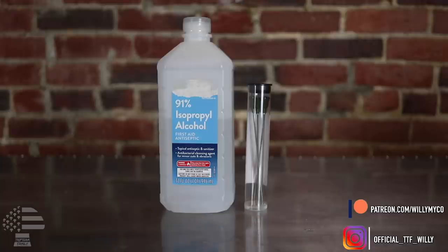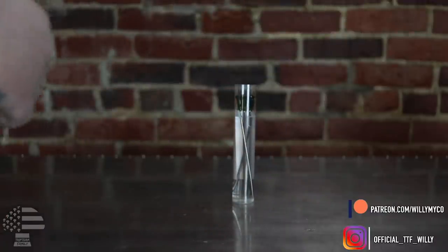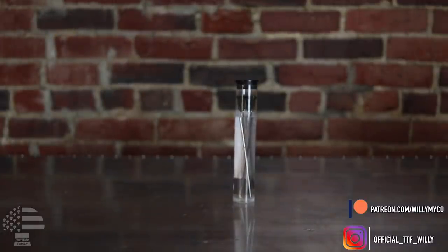First, make sure your liquid cultures are clean — you don't want to do this on LCs that could potentially be contaminated. I suggest testing all your liquid cultures on agar first to confirm they're actually clean. Once you know your liquid culture is clean, bring your LCs to your workstation — whether that's a still air box or flow hood. Make sure everything is disinfected, put on gloves, wipe your gloves down with hand sanitizer. Then open up your liquid culture needles and fill the jar they came in with 91% isopropyl alcohol, just until it covers the needle — not over the luer lock part.